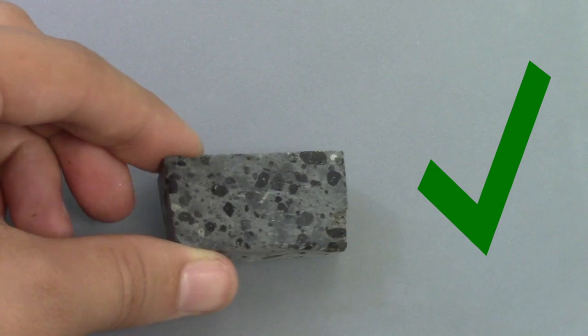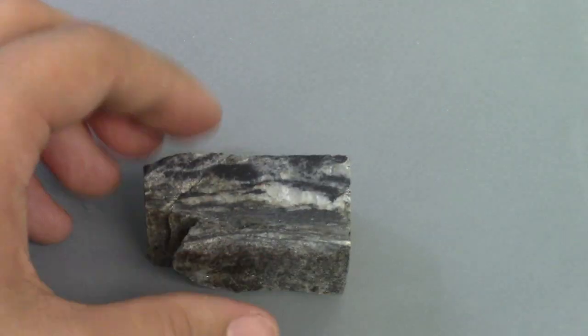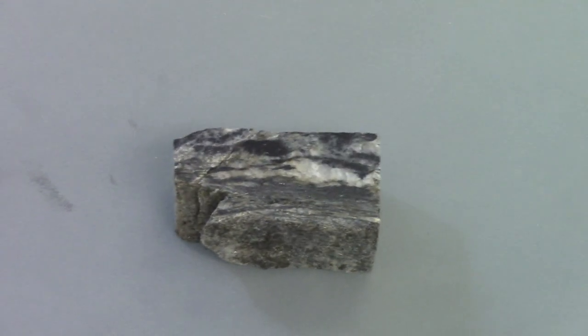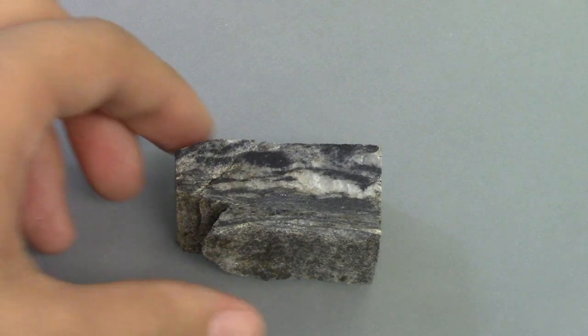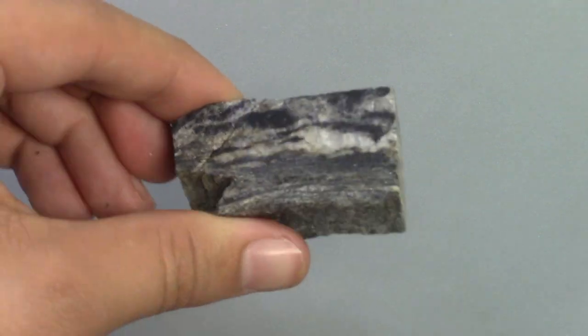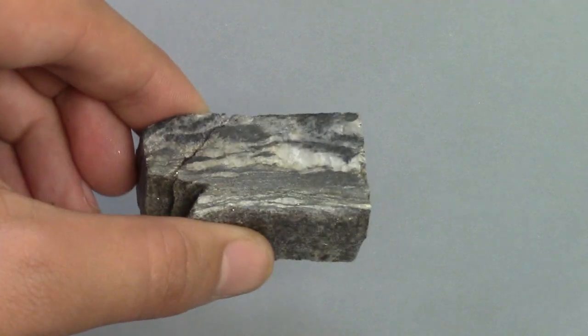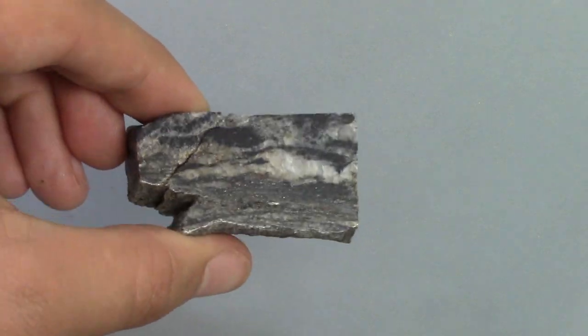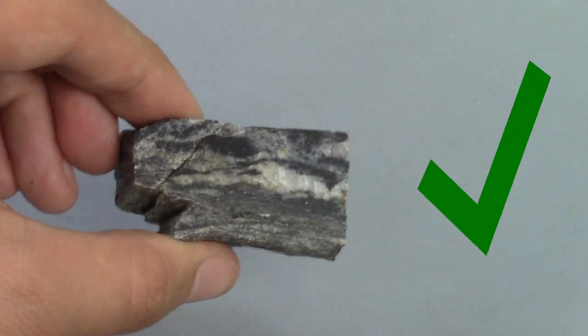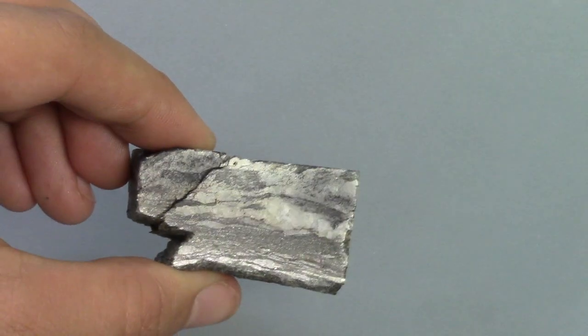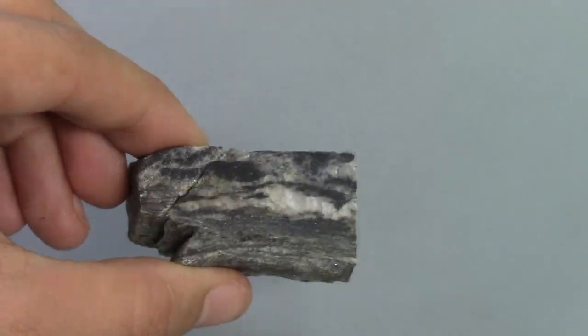We'll show another example. This is a metamorphic rock, it's foliated, it looks a little bit different. But again, if we pick it up and tilt it, you should be able to see that it's pretty much shiny all the way across. That's a good indication that you've gotten most of it polished.